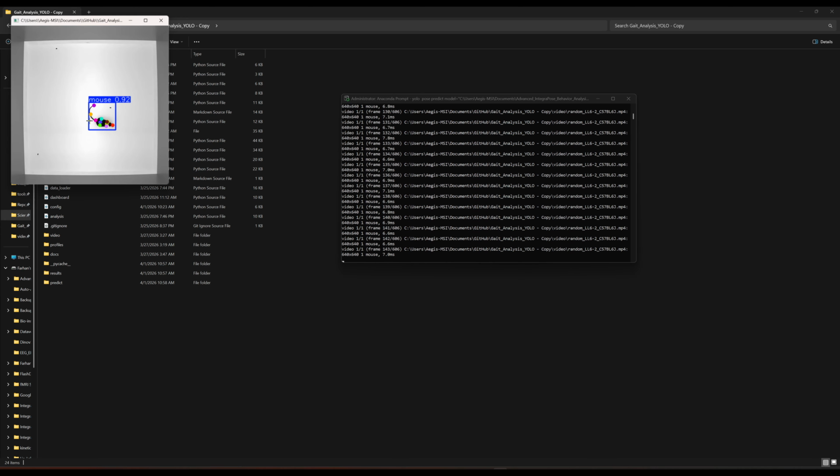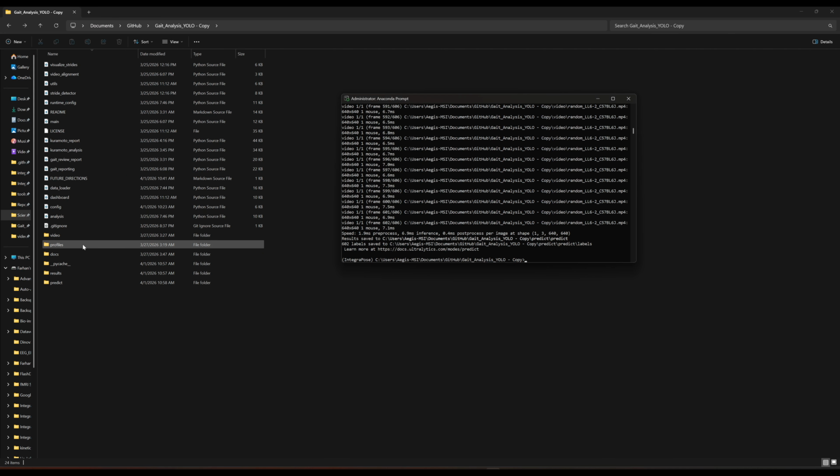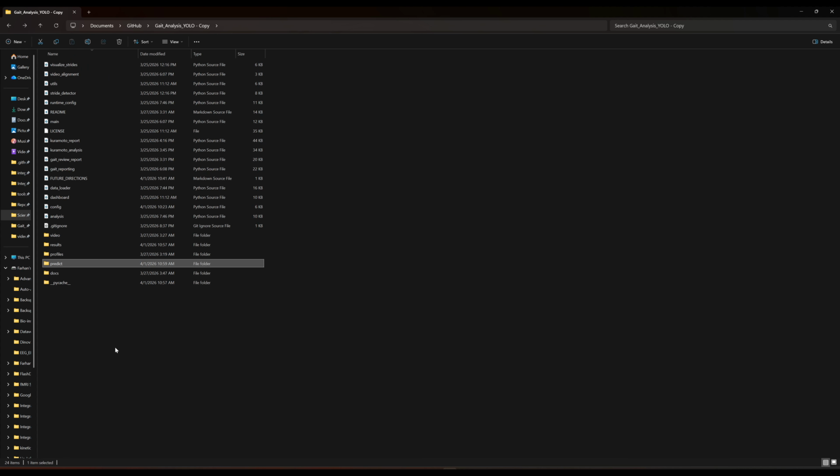So this is the video, it's running. Again, I'm using those shoulders and hips as the proxy for where the paws are. Okay, so that ended up running well. And this is where the predictions are. I'm going to move them up just one folder up.